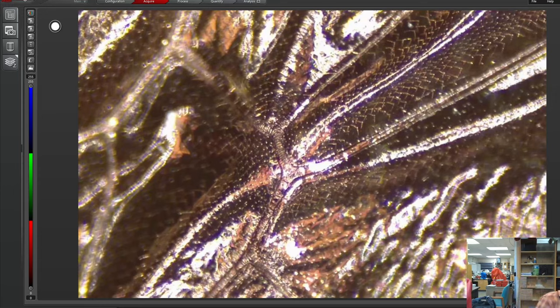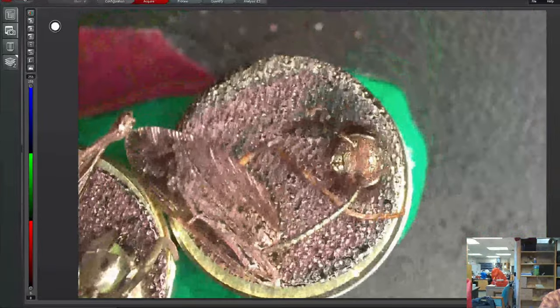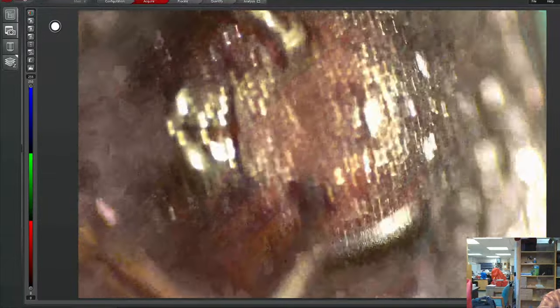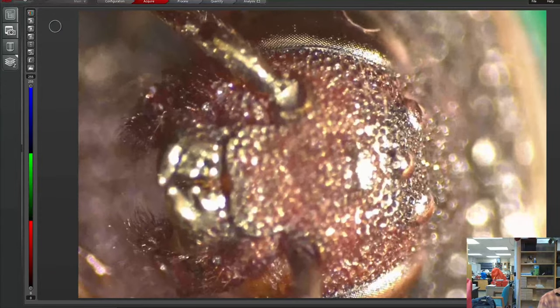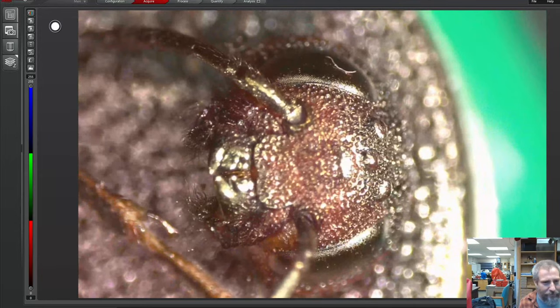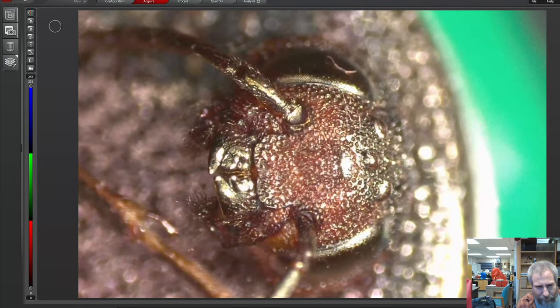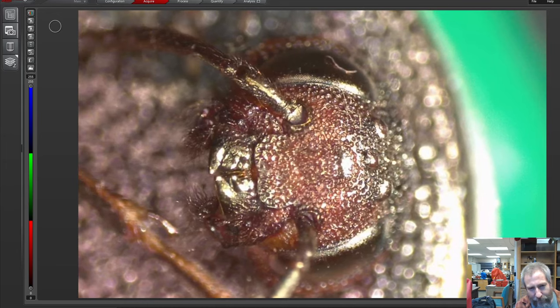And then I don't know if we even got around to looking at some of these other things on this set of stubs. This was the white-faced hornet. This was another wasp that we sort of bumbled into while I was looking for them. And the three little eyes on this one were really pronounced. Also, this one looks like it's got a kind of cool sideburn thing going on on the side of its jaws here.